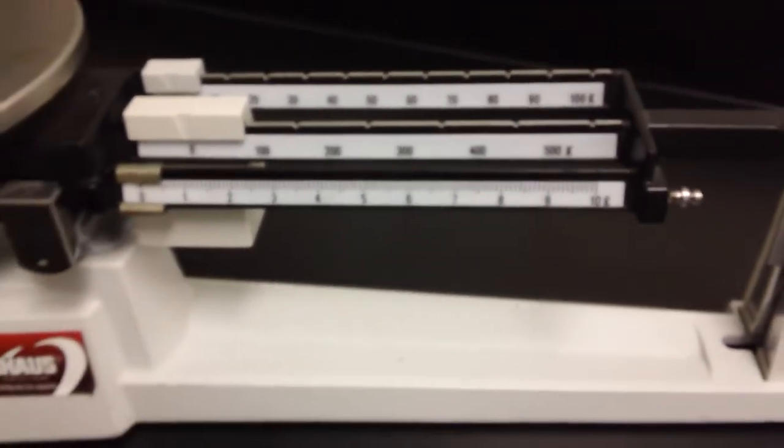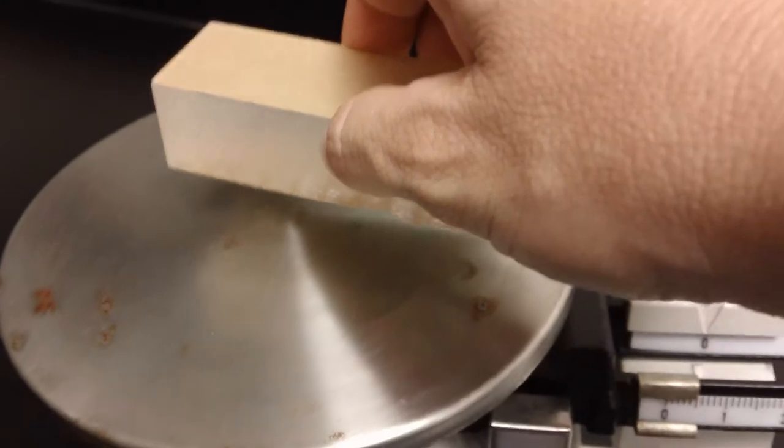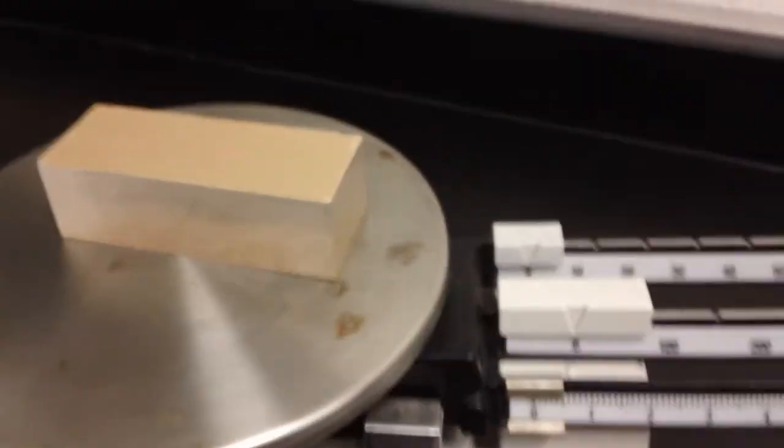So let's go ahead and start doing some measuring here. I'm going to take my block and put it on the plate. Now, you want to make sure that you don't drop it on the plate, because this is kind of a delicate instrument. So as you can see, once we put the block on the plate, we're no longer zeroed out.